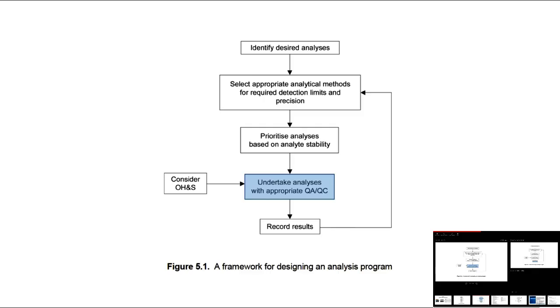And finally, and this may seem a little self-evident, but you need to record your results. And this is really important, because you not only need to record the finding, but you also need to record the process of arriving at that finding. That's part of the QA and QC that we talked about a minute ago. But it's also very important that you record your results somewhere, that you can go back to those results and check them as you need to.